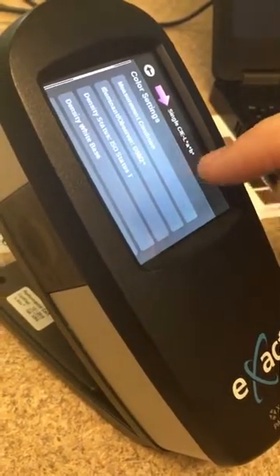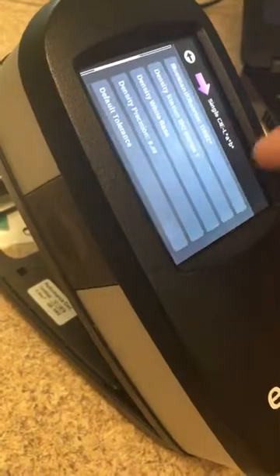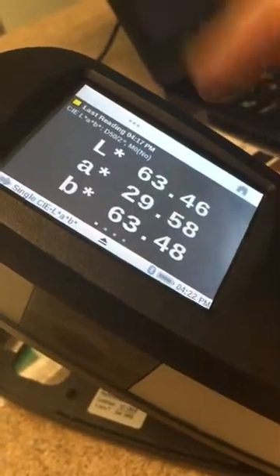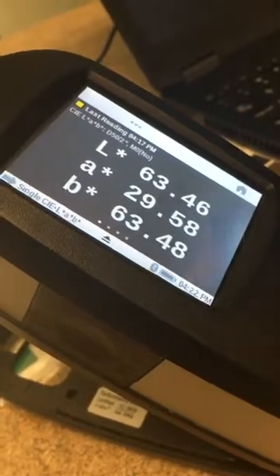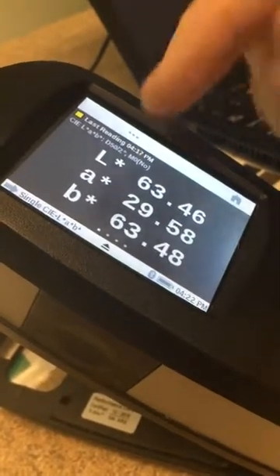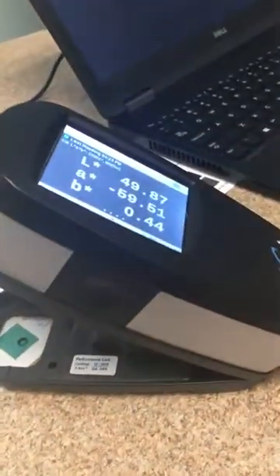In Settings, you can change the measurement condition — M0, M1, M2, and M3 — and define whether your densitometer readings come one way versus spectral data another way. You can also change your illuminant observer, density status, and several other settings. Anytime you get lost in any menu structure, there's a home button — push it and it goes back to the main menu. From here, the instrument is ready to take a LAB reading: line it up on the patch, go down, take a measurement, and there are your LAB values.